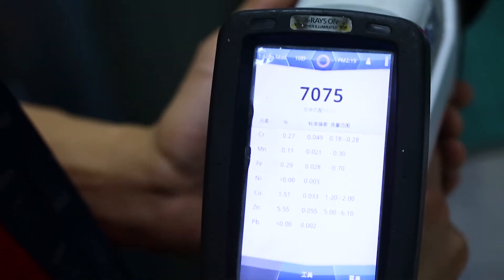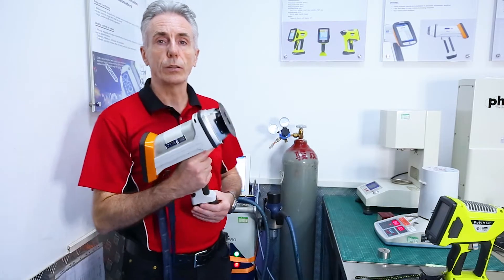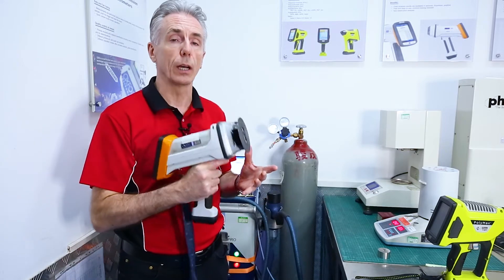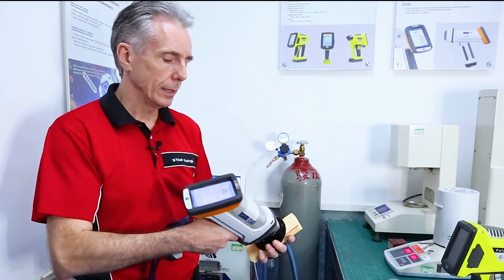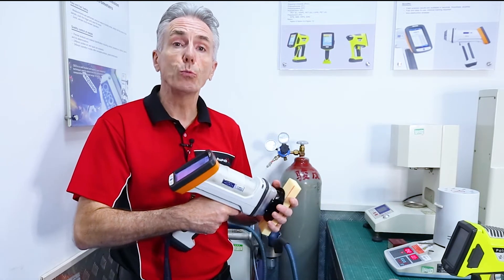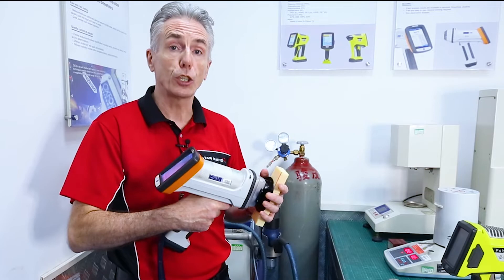So you can use this for incoming inspection and also finished goods. This can also do what's called ROHS testing of plastics. Even though this is a metals gun, you put it on the plastic, run the test, and it will tell you what heavy elements are in there that shouldn't be in there.